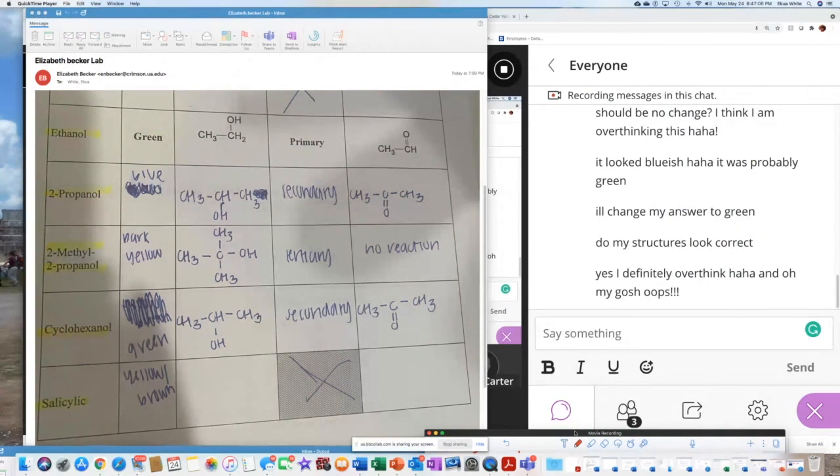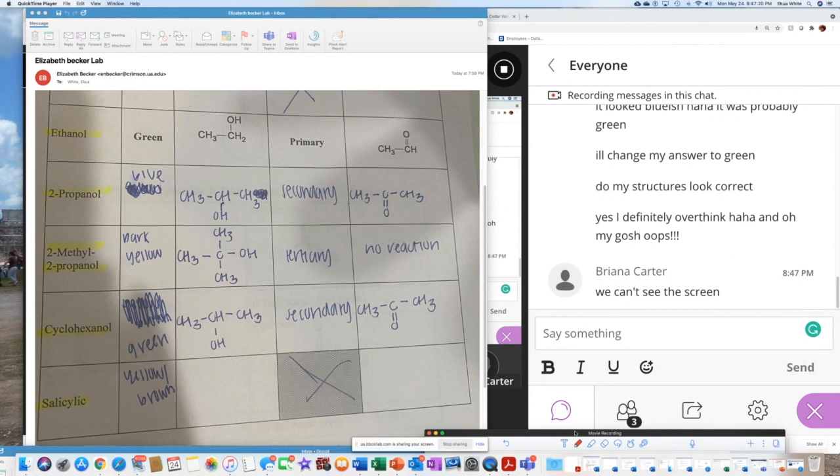this, right? So what's the color it changes to? Green. Oh yeah, sorry, my bad. Green. Yeah, they're supposed to be green. So that's good. Green, right?